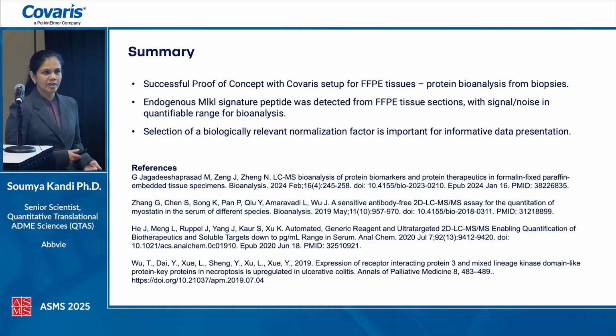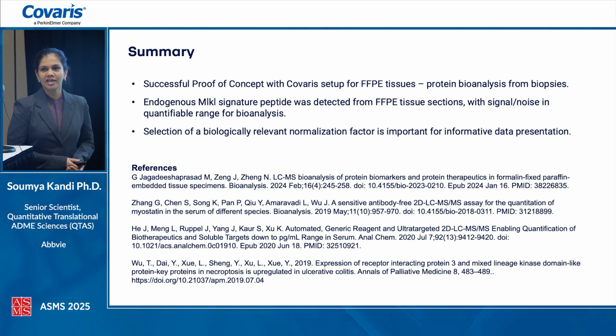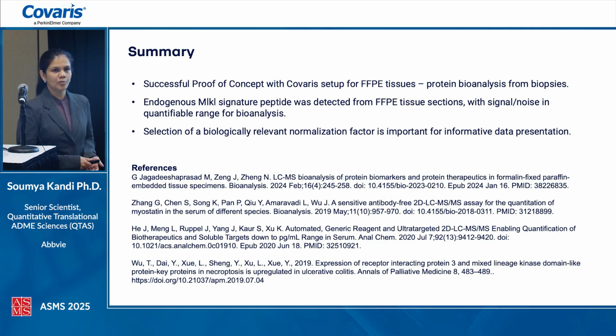All of these samples were able to provide us with detectable and quantifiable levels of MLKL. There is some work to be done in terms of assessing the preparation of a calibration curve and things like that. But I just want to point out one last thing: it is absolutely necessary to determine what the right normalization factor is. Because without this, we were seeing the data trend in opposite directions with biopsy tissues. But when we chose the normalization factor that made sense for this, it helps with having a better, more informative data presentation, so to speak.